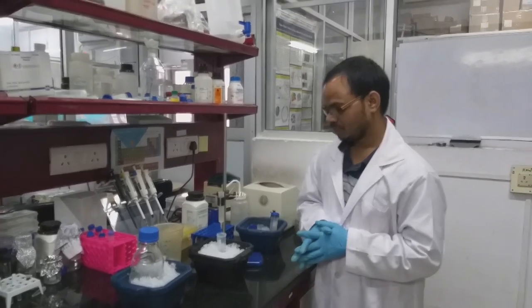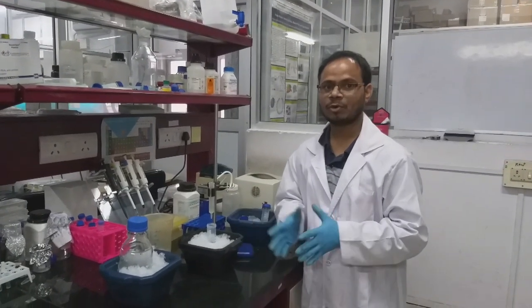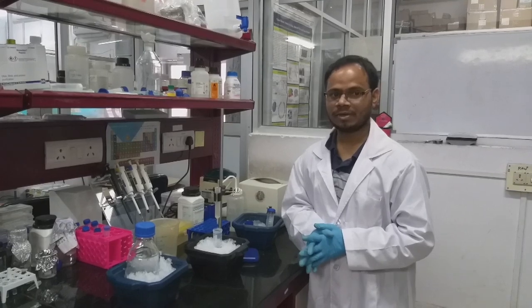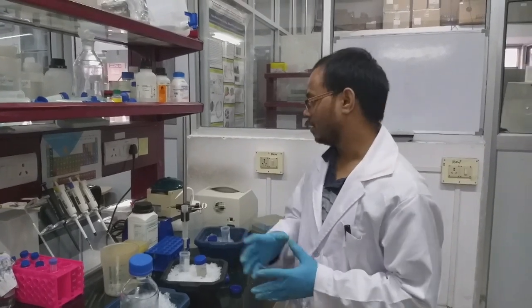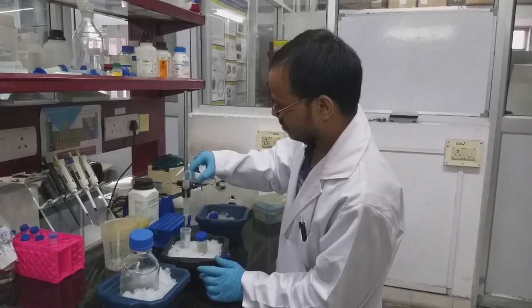So this is the flow through. Whatever we are getting is flow through. Next step, we will wash with the lysis buffer. In this step, we are going to wash with the lysis or equilibration buffer. So this is the lysis buffer.